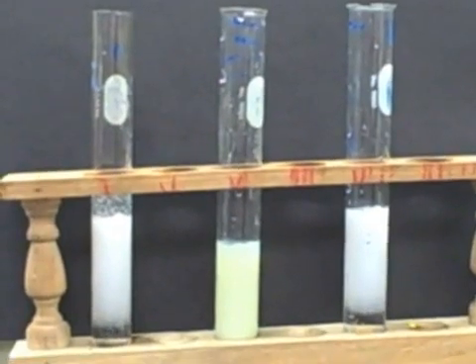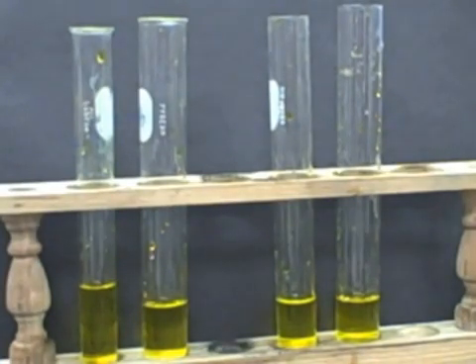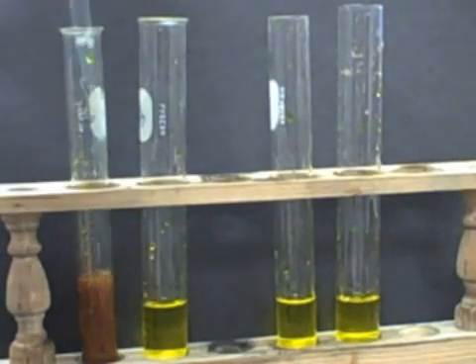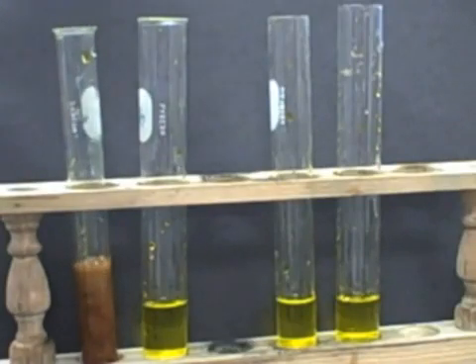So those are halides. So now we're going to do some chromates. I actually have no idea how this is going to turn out. We've got our beautiful yellow color of sodium or potassium chromate there, and now we're going to add copper sulfate to the first test tube. Wow, copper chromate's like a reddish color. That's great. That's very unexpected for copper. Looks like something iron would do.